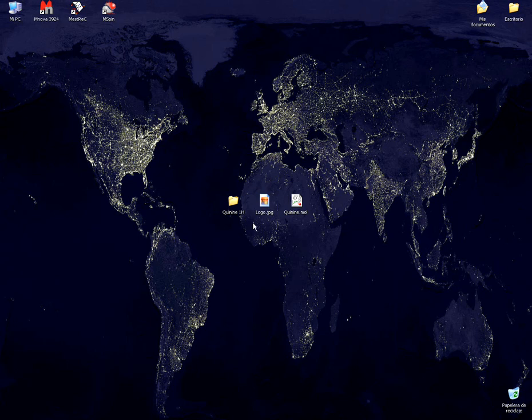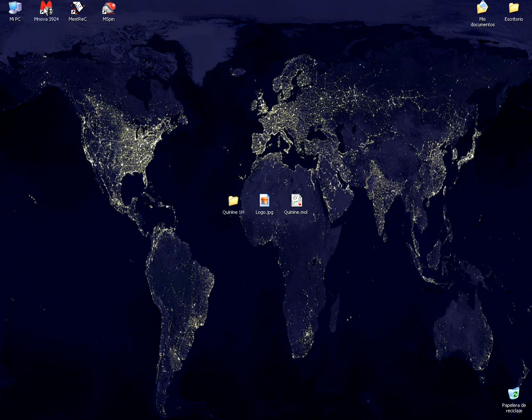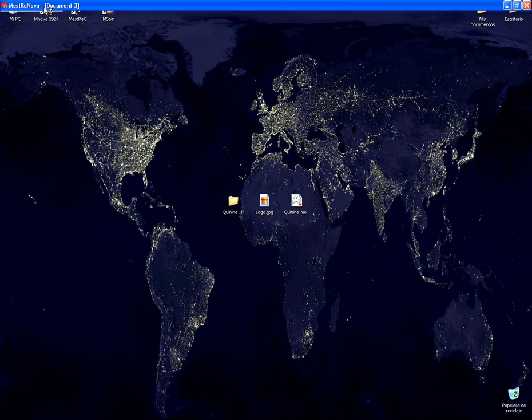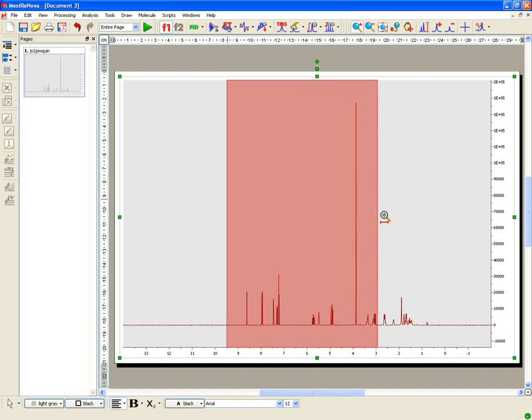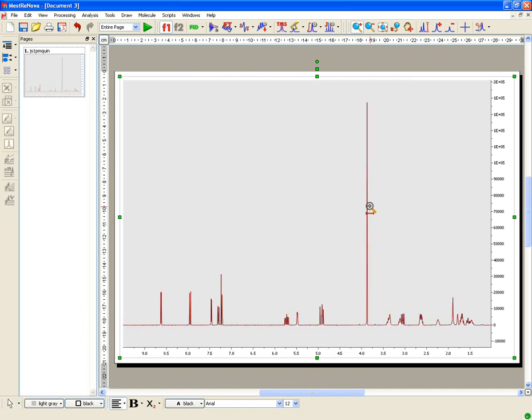As you will see, it is very easy to process a routine 1D NMR spectrum. Just click and drag the NMR folder terminal over, and the spectrum will automatically open already processed and with the phase corrected.